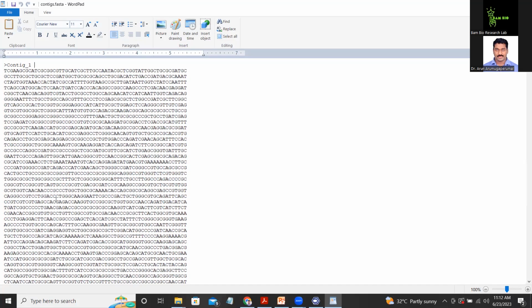So our next step is annotation, to find out the identity of the sequence, and we will write it over here. If it is protein disulfide isomerase, next to contig_1 we will write protein disulfide isomerase. Since we have thousands of sequences, we cannot do it manually, so we allow the software to do it. The software will take this FASTA file, write the name of the sequence in the first line next to contig_1, and then give it back. Now this sequence is called an annotated sequence. So I will show you how to do it.